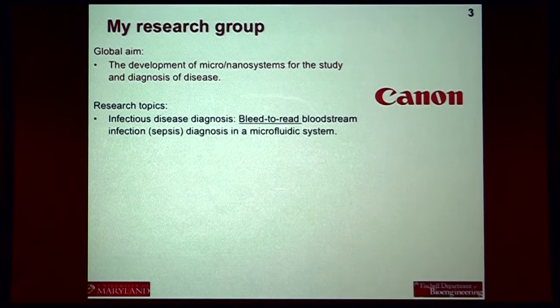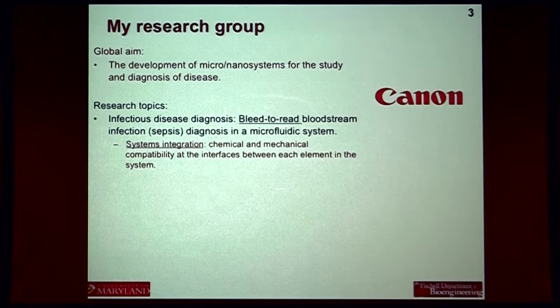Since we're in an ISR seminar, I want to focus on, when I can, what it is that we think of as a system in our research components. So in this case, where we really have to focus on systems integration is we have to develop a lot of new components that will perform certain functions. So one component that will take in whole blood and quickly break it down, another component that will pull out bacteria and extract DNA, another component that, and so on and so forth. So there's a lot of challenges at looking at the mechanical compatibility of each one of those components.